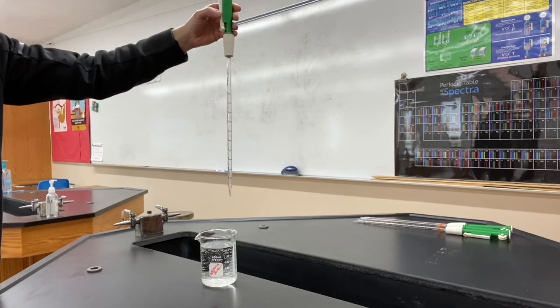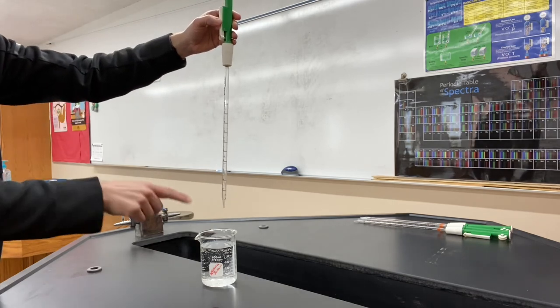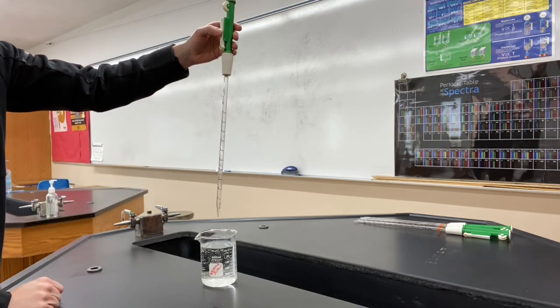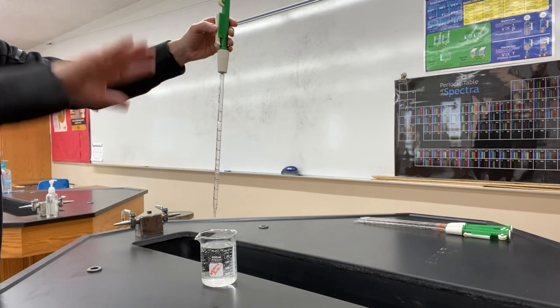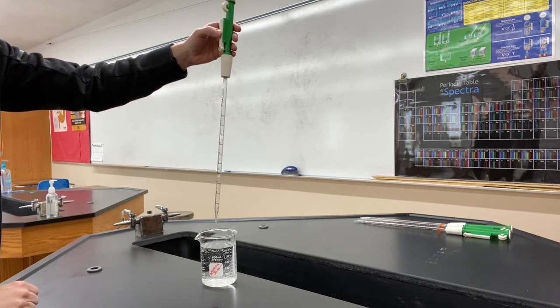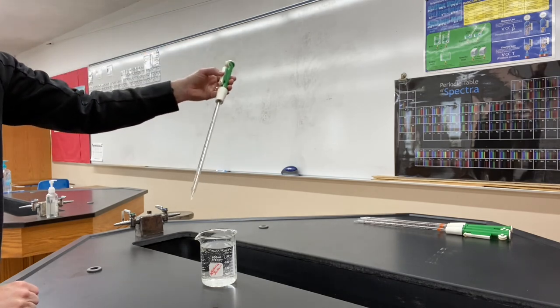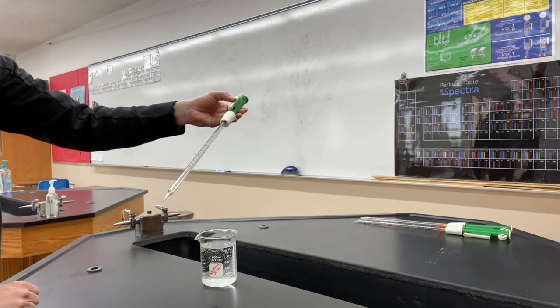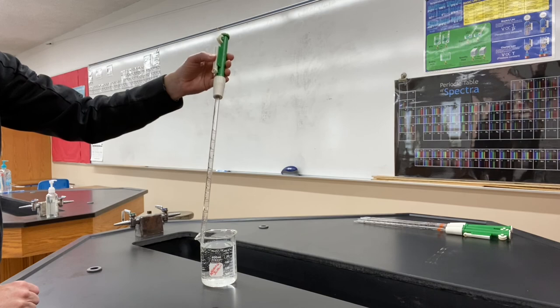You know, again, if I wanted to measure 25 milliliters total, I would do 10, 10, and then 5. And you really want to be as close as possible with that meniscus on each measurement, okay? So that's a quick introduction on how to use a pipette, the pipette pump. You'll have a chance to practice with these before we actually use them in the lab.